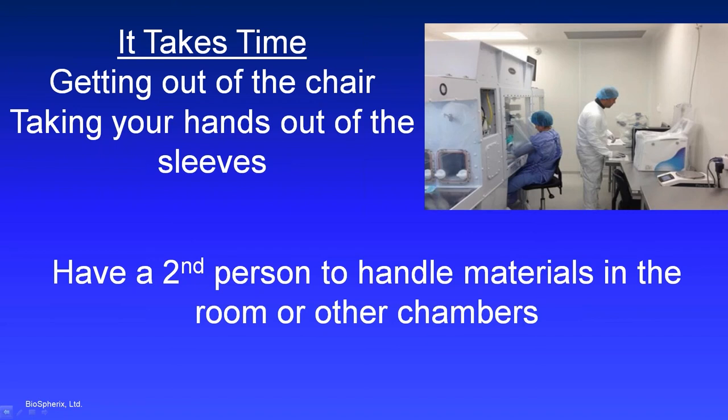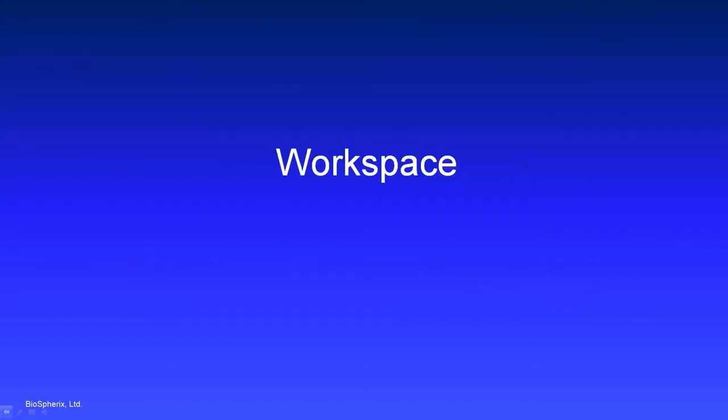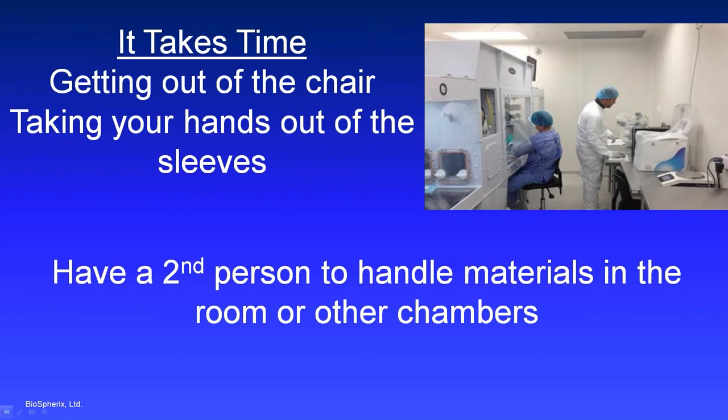This will save you a lot of time. Oh, but let me go back and say, notice this person's kind of hunched up at the Xvivo processing chamber. If they set their chair just a few inches lower, they might be able to sit a little straighter and get their body closer to that glove front for more comfort.